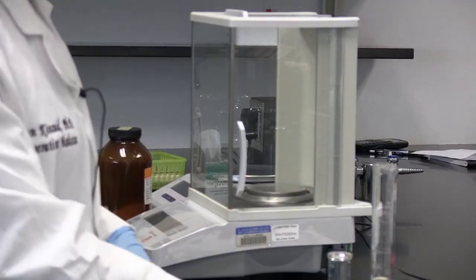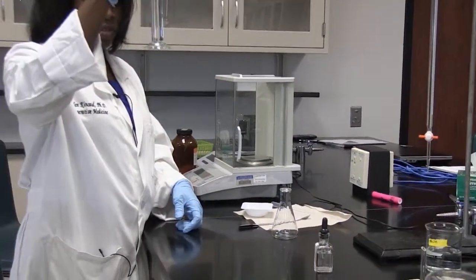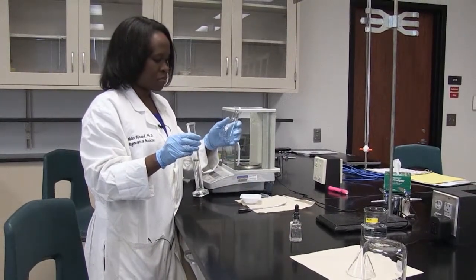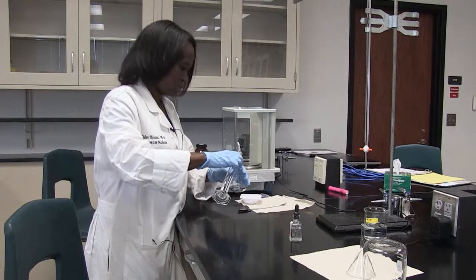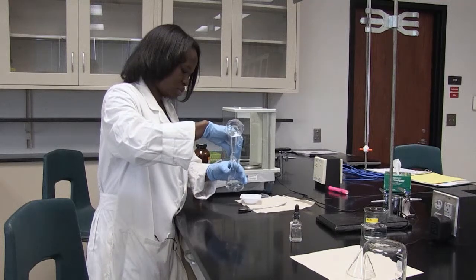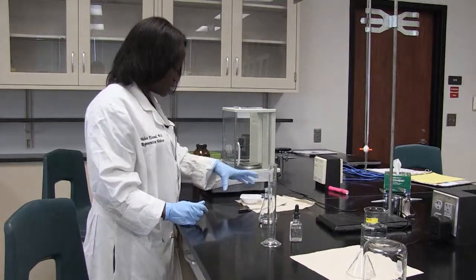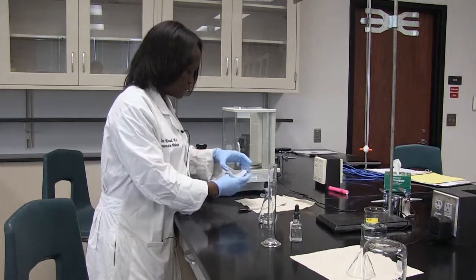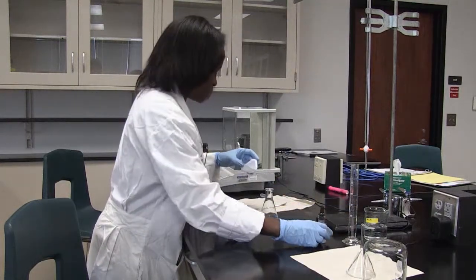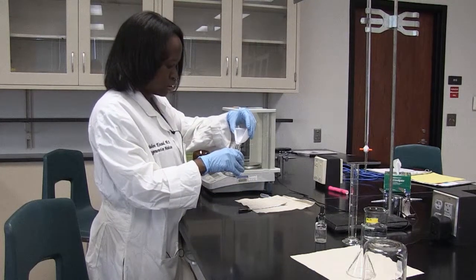Here I have measured 30 mL of distilled water. I'm going to add that to a 125 mL Erlenmeyer flask. And I'm going to try to get as much of my KHP crystals into this Erlenmeyer flask as possible. So I bend my boat here to guide the crystals into the Erlenmeyer flask.